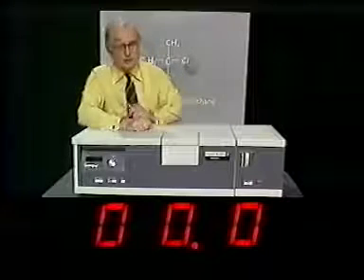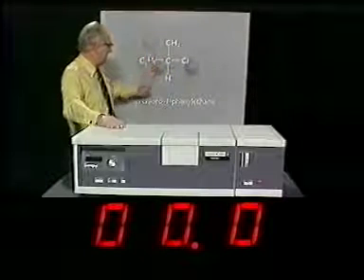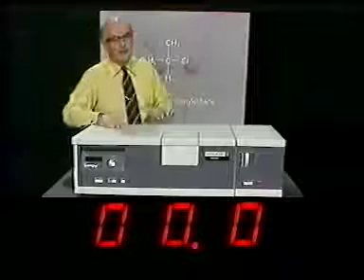Now, in this case, you can see that the result is quite clear-cut. You can see in the readout that there is, in fact, zero net rotation, none at all. So we can say with some confidence that our initial chiral chloride, this one here, the 1-chloro-1-phenyl ethane, has indeed reacted by the SN1 pathway.